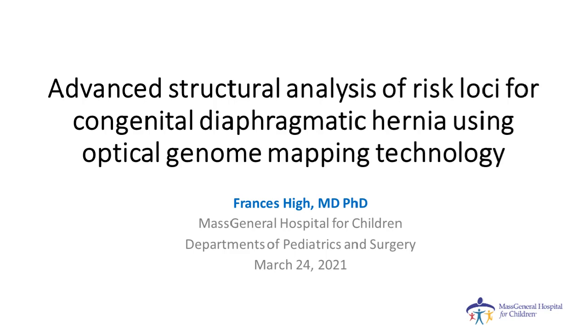During the webinar, she'll explore the evidence for a genetic etiology of CDH, review case studies of the disorder, and compare platforms for assessing structural variation and understanding how optical genome mapping can offer improved resolution of clinically relevant structural variants. She'll be on hand to answer any questions at the end of the presentation, but please remember that you can submit questions at any time throughout the webinar.